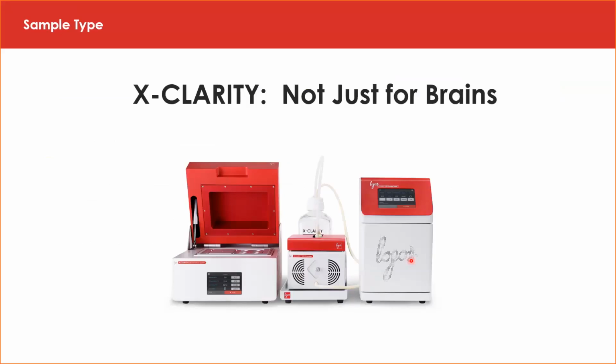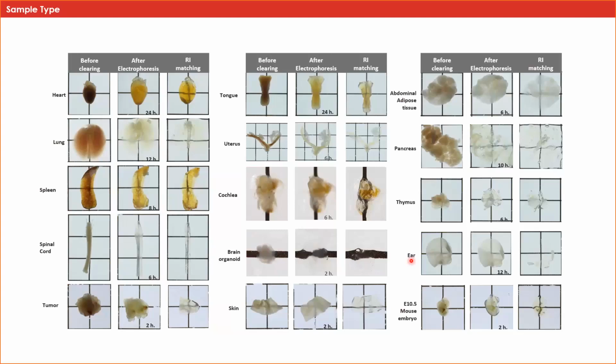After we discuss the imaging system, then we move on to more detailed discussion around the tissue type to be cleared, features that you want to capture, and the volume that you will need to adequately capture those features. Tissue clearing came to prominence for its ability to clear neuronal tissue. However, it can be used for a breadth of other tissue types.